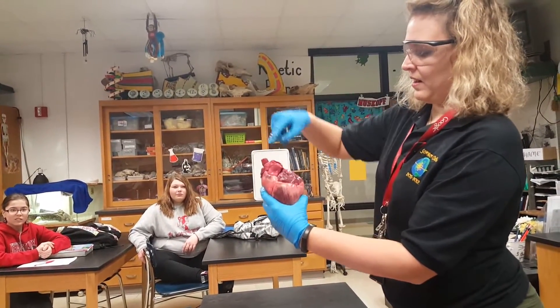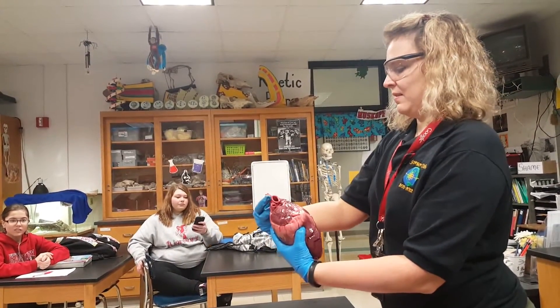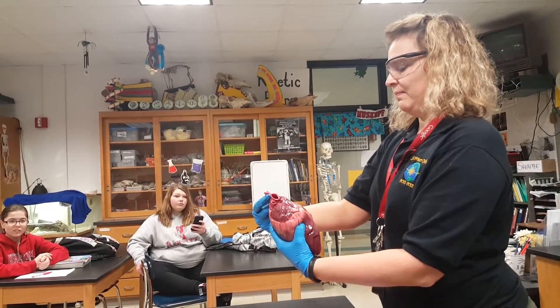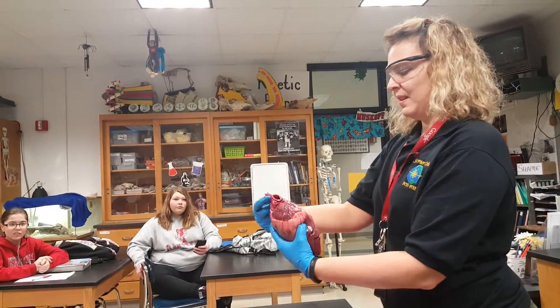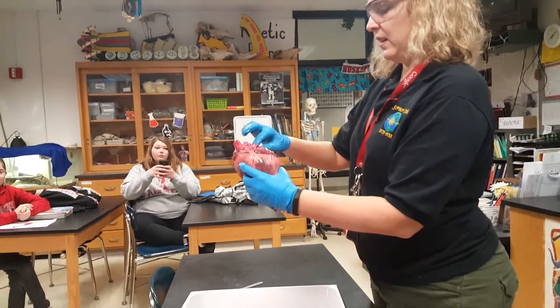Pulmonary. How about this one? Aorta. That would be an aorta. Well, here's the aorta. So that's the brachiocephalic.